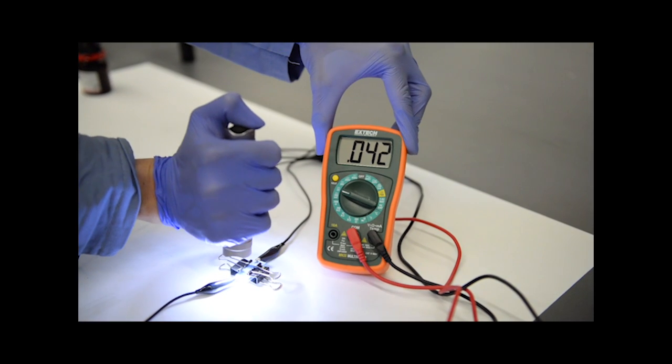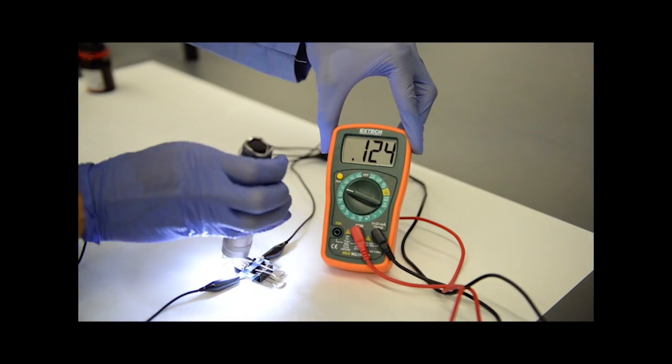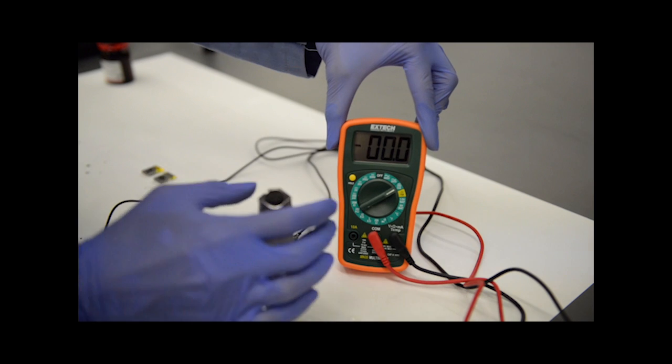We measure voltage by turning the multimeter knob to the 2-volt mark. We measure current by turning the knob to 1 milliamp mark.